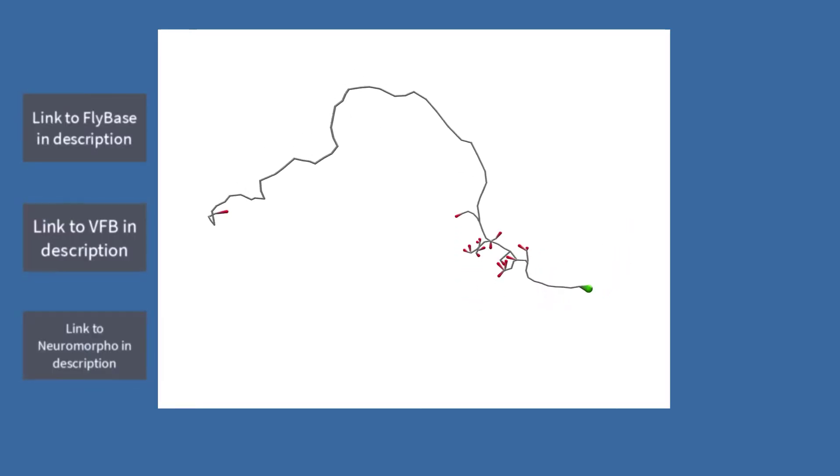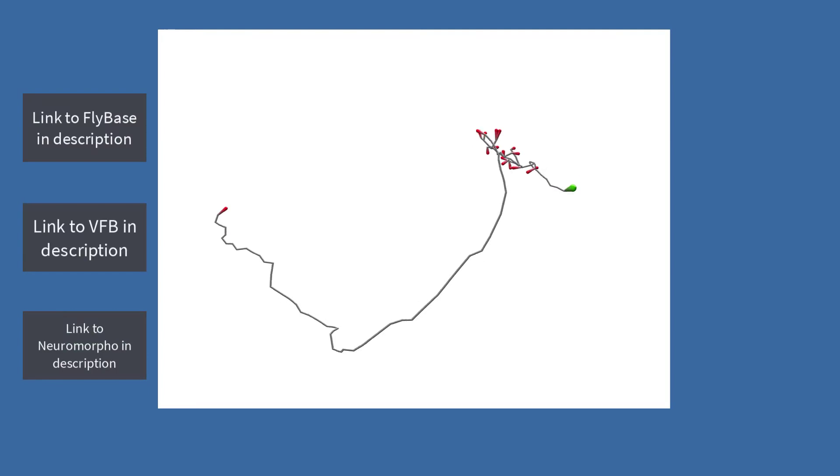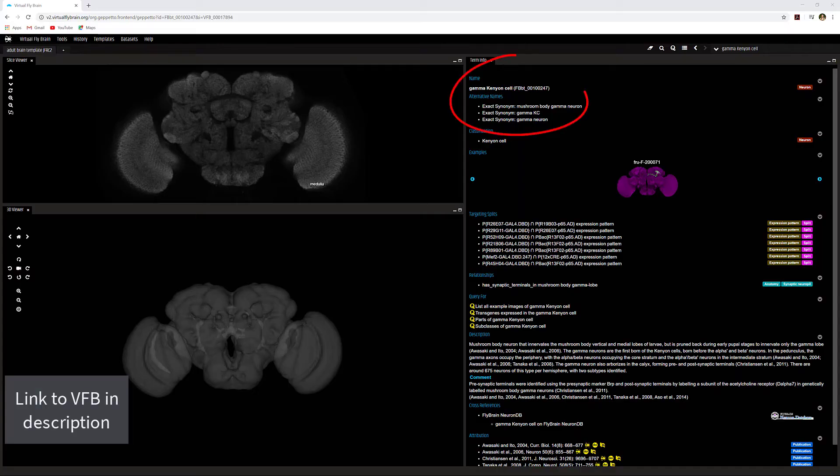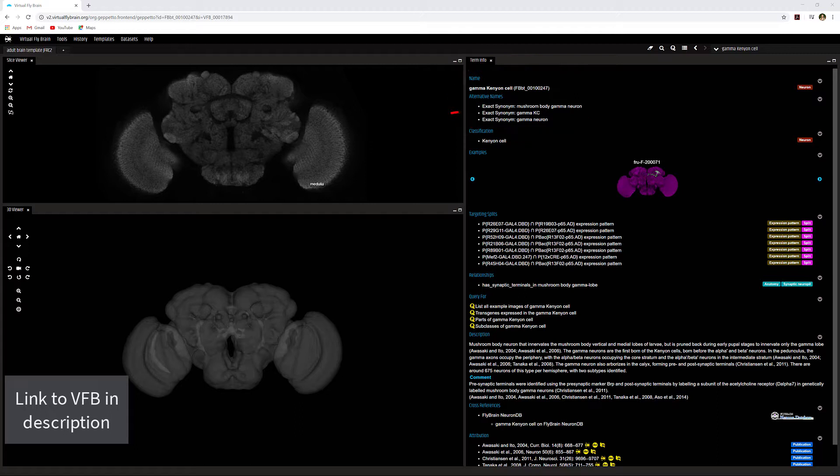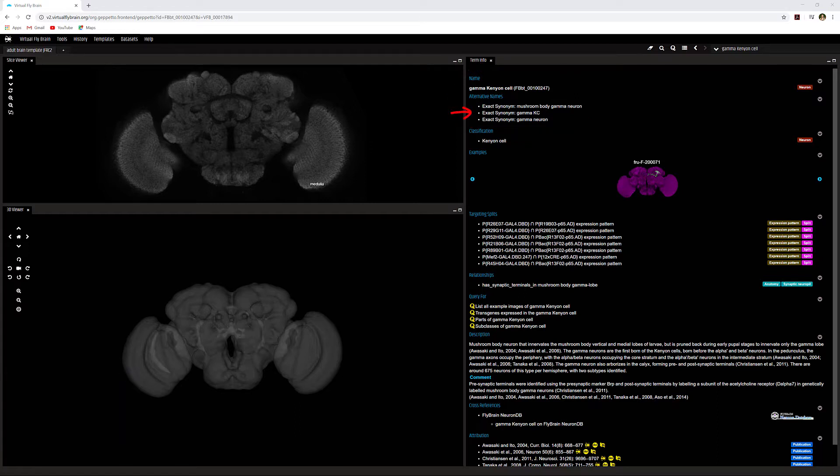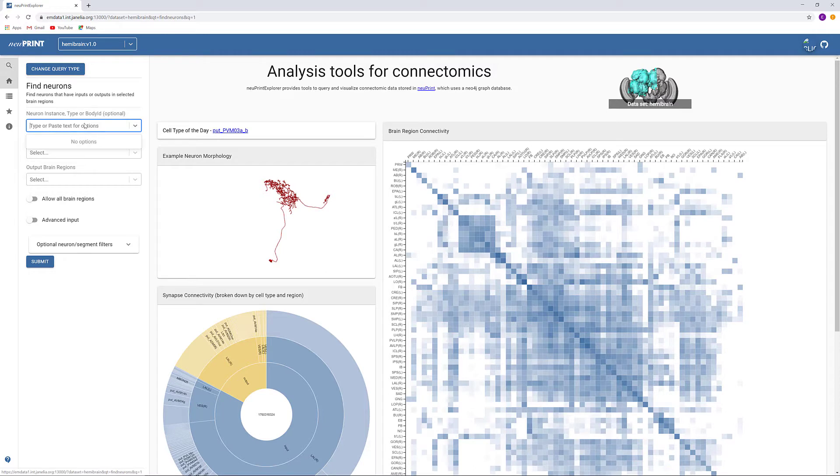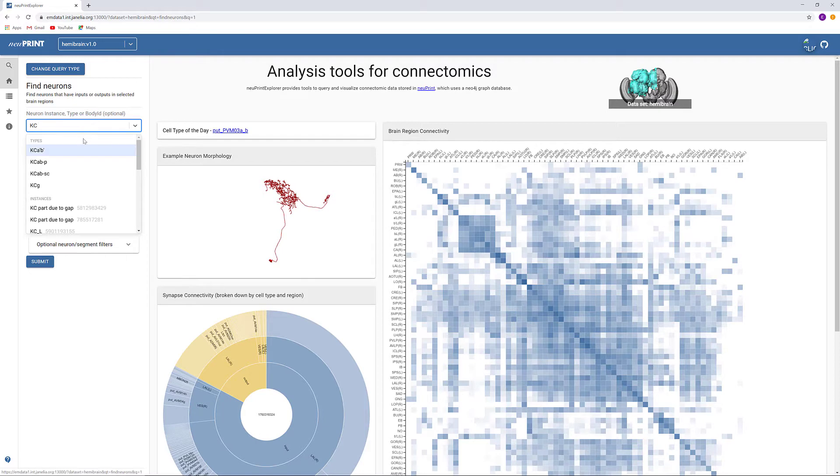From other sources, we know roughly what we are expecting, and we know that the name may be similar to one of these listed synonyms. Since NewPrint types are abbreviations, we can start with KC as it is the standard abbreviation for Kenyon cells. We can use the Find Neurons built-in query to find our Gamma Kenyon cells. We will start by searching for KC and see what suggestions we are given.